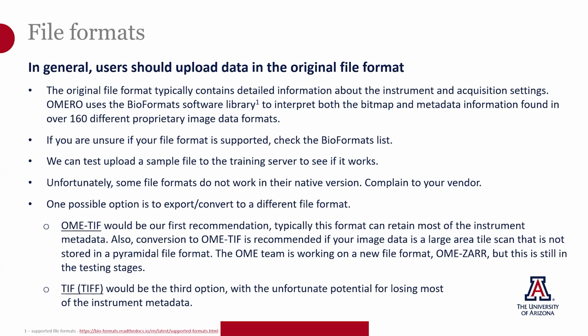If needed, we can test upload a sample file to our OMERO training server to see if it's going to work. And unfortunately, some file formats don't work in their native version. If you discover that that's a problem that you're facing, please complain to your vendor, number one. And then if we do find a challenging file format, one possible option is to export the data, convert it to a different file format if we can. Converting the file to an OME TIFF would be our first recommendation.